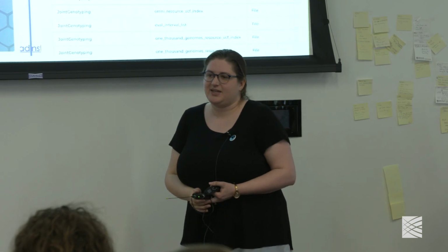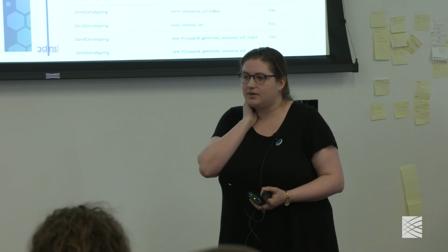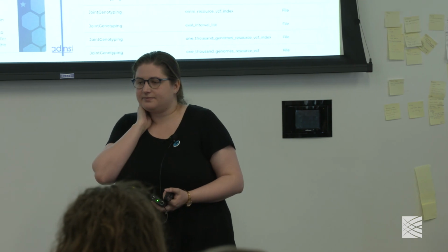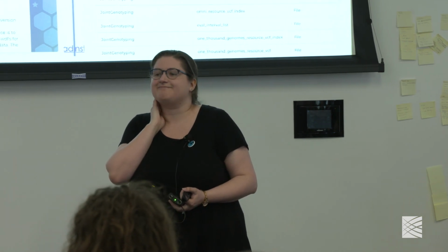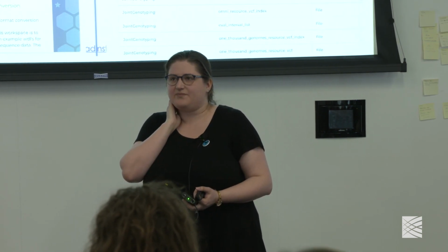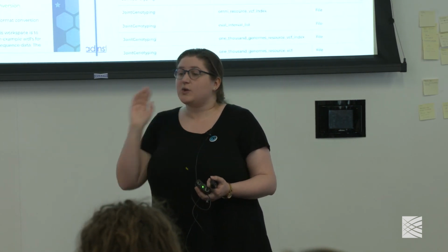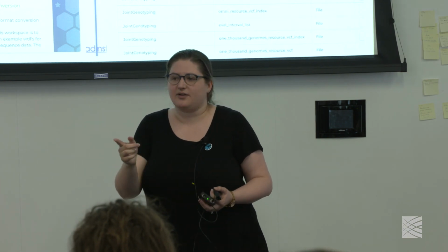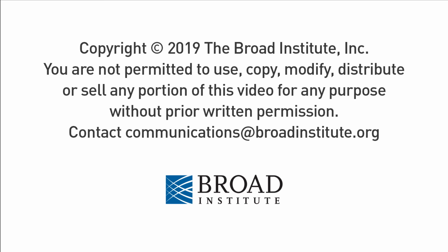So I guess all these tools have been tested on whole exome or whole genome. Can you apply this on, for example, targeted sequencing that only covers hundreds of genes with higher coverage, but just fewer regions? So I think you can definitely still run these pipelines. It might take some tweaking of some of the parameters, and maybe we can talk offline about the specifics of what your data looks like.